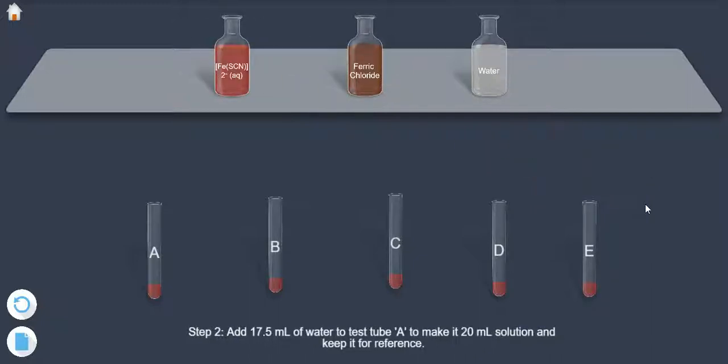Add 17.5 ml of water to test tube A to make it 20 ml solution and keep it for reference.